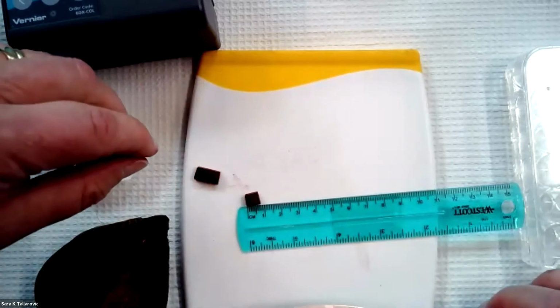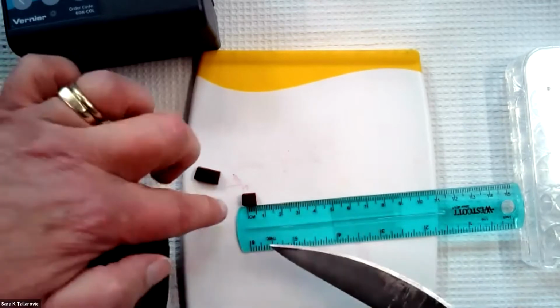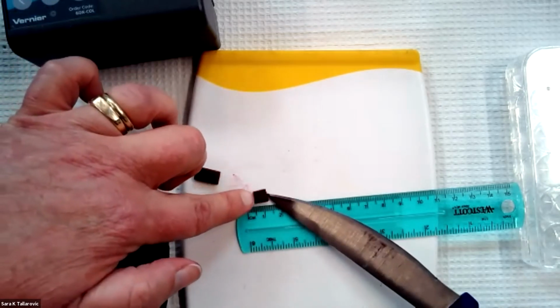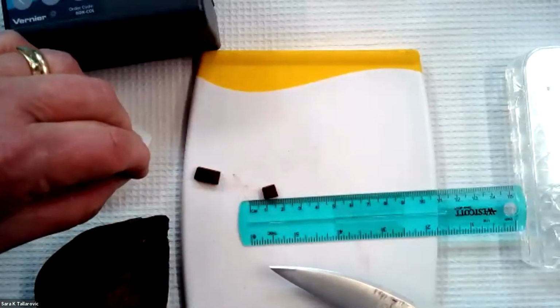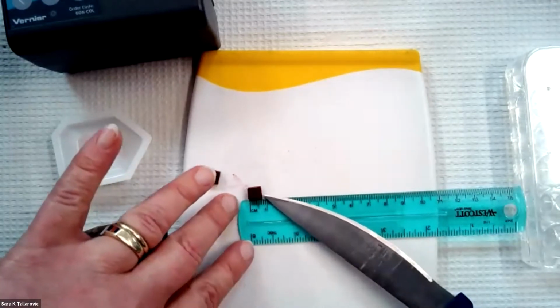I personally like to have a balance nearby so that I can measure the weight of the pieces to make sure that I'm getting roughly the same size of a cube of beet. But it's something that if you're going to do it in lab, you might want to practice. You could certainly have your students cut it as well, depending on how much you trust your students with sharp objects like knives. I do recommend using a very sharp knife.